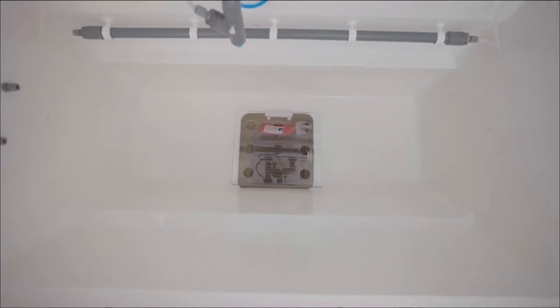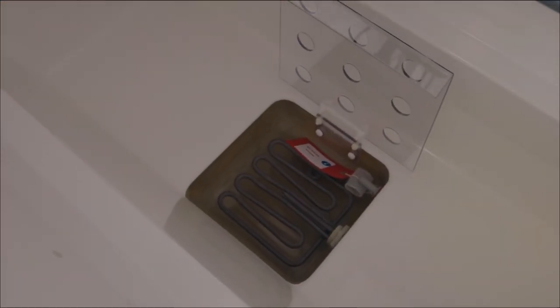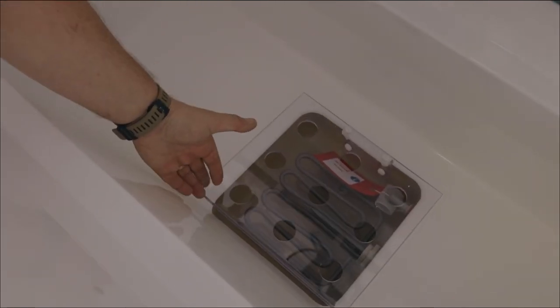In the base of the chamber we have a titanium heating element which is used for humidity generation.